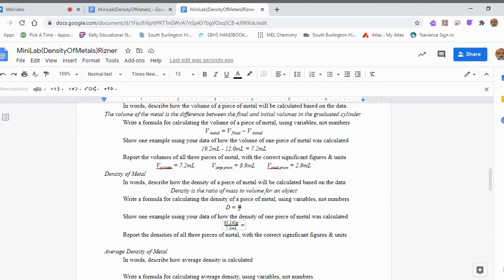And our calculator gives us an answer of 8.491666666, repeating, of course. And so we're going to need to round that for correct sig figs. Since this is division, it follows the rule based on number of sig figs. The top number, the mass, has 5 significant figures.